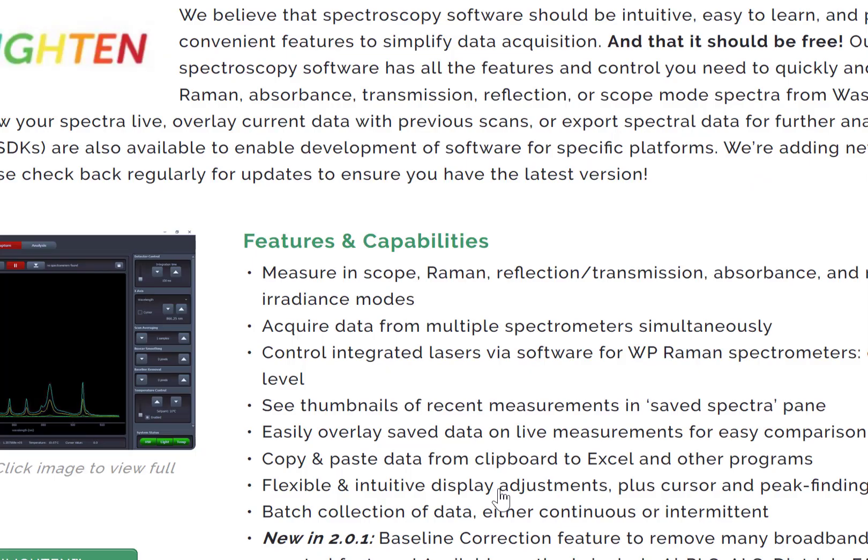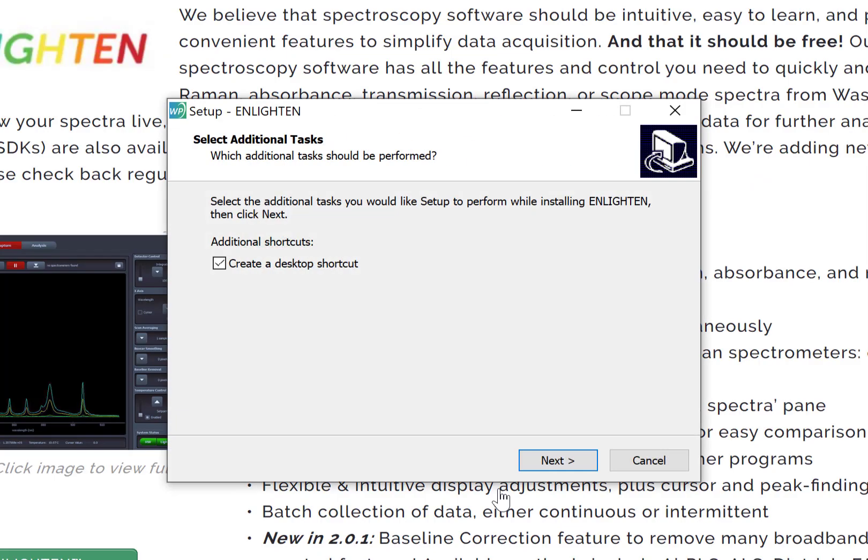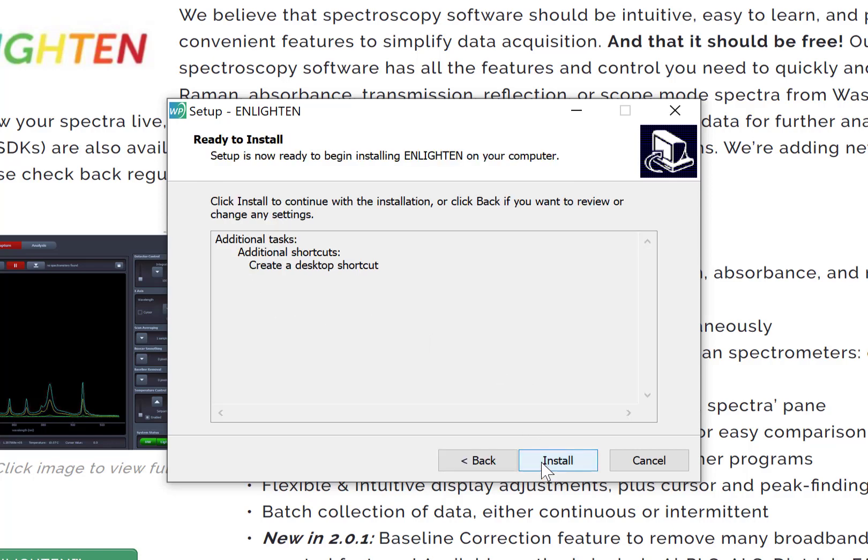A new setup window appears that asks if you'd like to create a desktop shortcut, and we recommend that you select this feature. Then click Next, and finally you'll be asked to install the software.